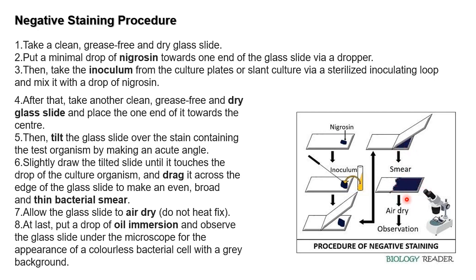Now just keep it for about one minute to air dry. You do not heat fix in this method — you simply air dry your smear and then observe under the microscope. You need to observe under the oil immersion lens at 100x. Put a drop of oil immersion, fix the lens properly, and adjust it so you can observe the slide clearly. Your result will show a background stained gray with colorless bacterial cells. Your slide will be ready within 4 to 5 minutes.